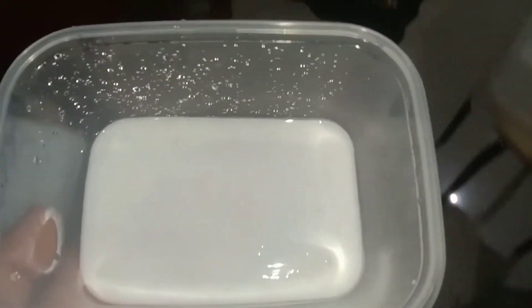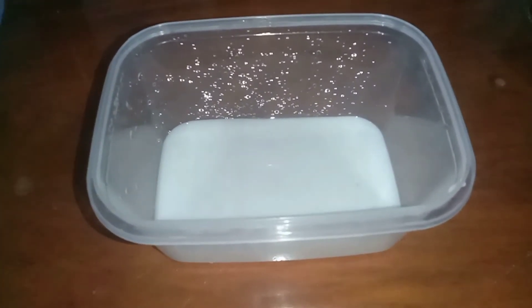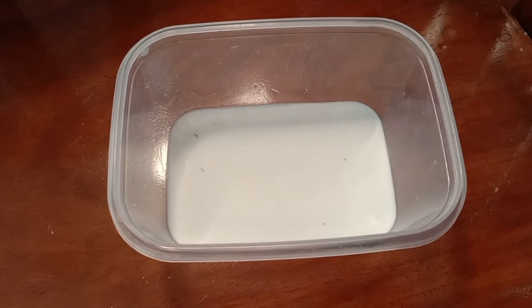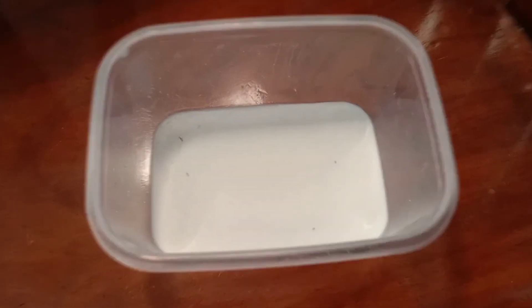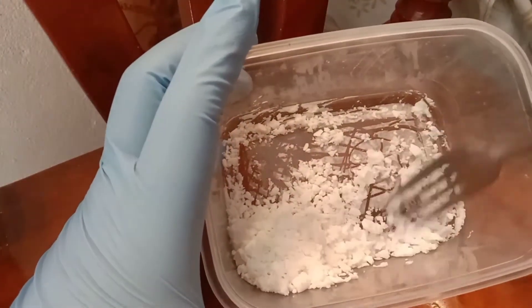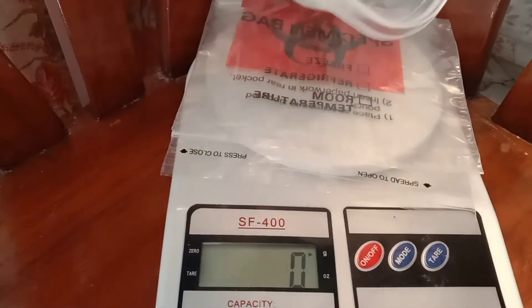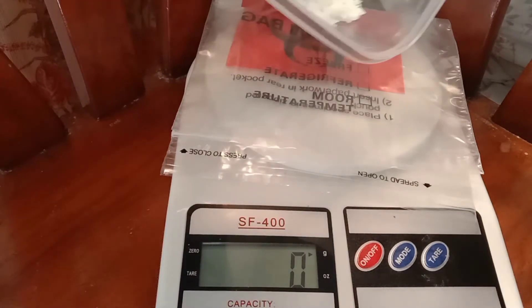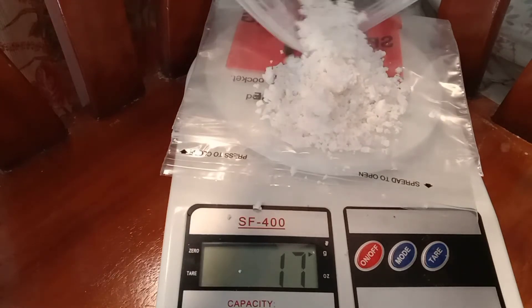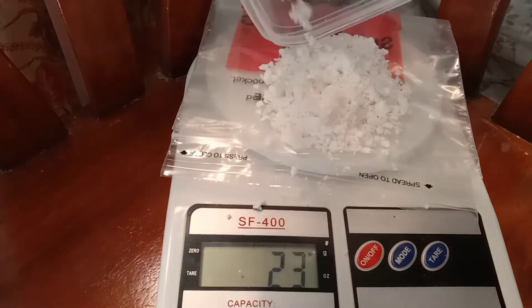This is the starch. We will now let the starch sit until it dries. Now that the starch is already dry, we are going to pulverize it and weigh it. Using the digital weighing scale, we are now going to weigh the starch that we have collected from the potato.